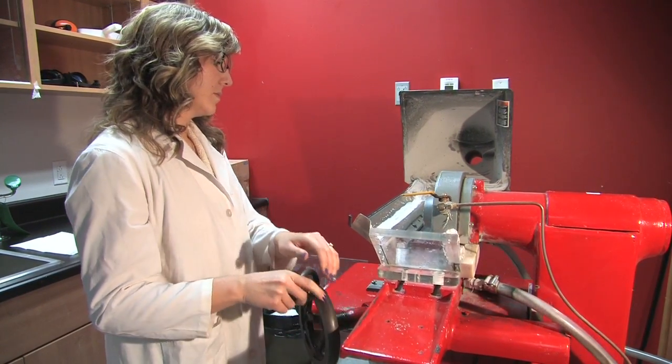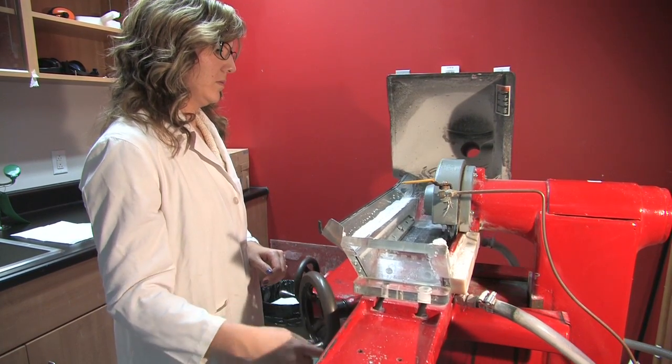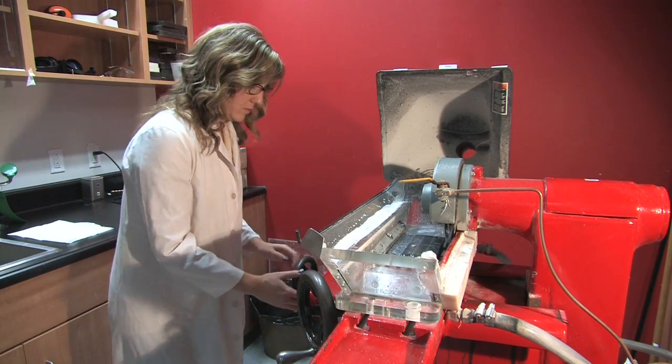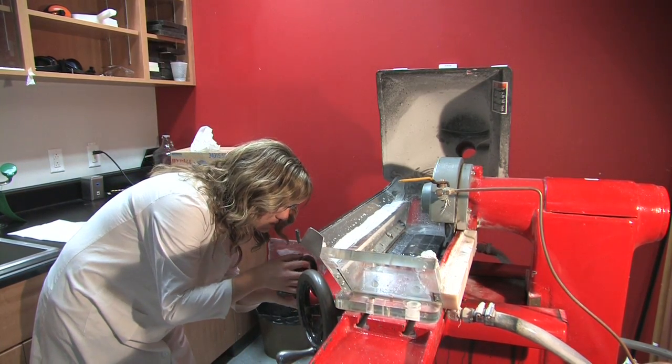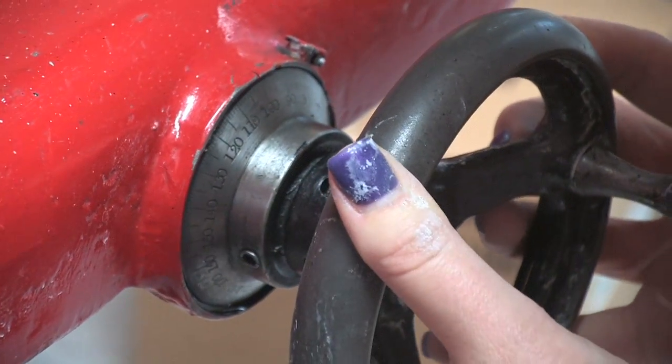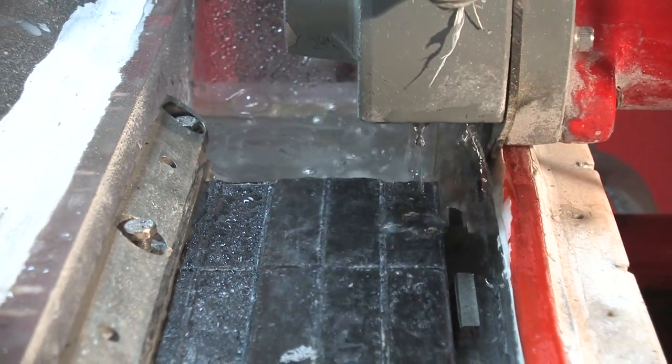Once you make your first cut, move the blade back to the starting position. We are now ready to remove the cores of the otoliths. Move the bed of the saw so that the blade is aligned with the center of the ridge. This is done by turning the small wheel 70 increments. The result is a 1mm section.